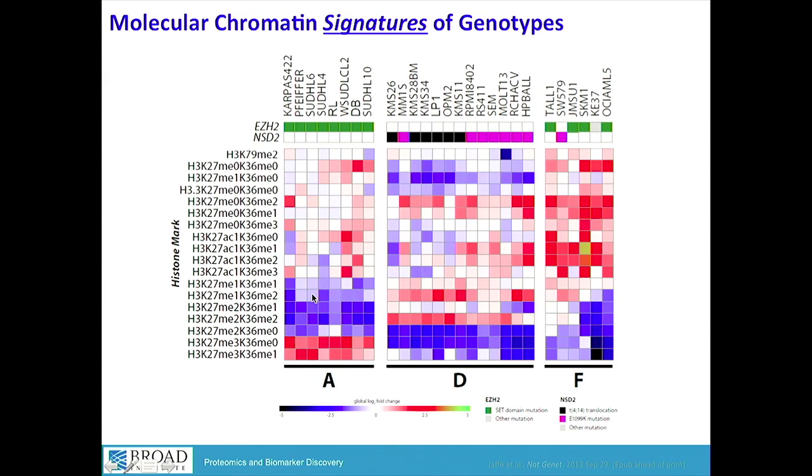analytes. Some analytes, let's take this cluster A, some analytes here are down, some analytes are up, some are sort of intermediate, a subset of them might have that up, but we could distill from this a pattern or a signature that typifies this cluster.